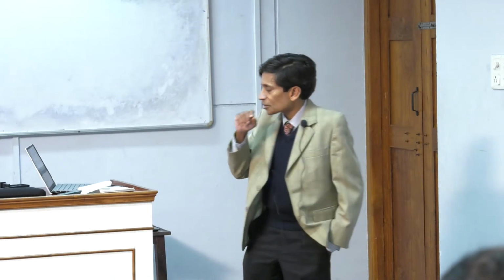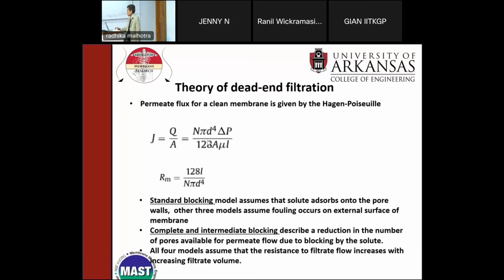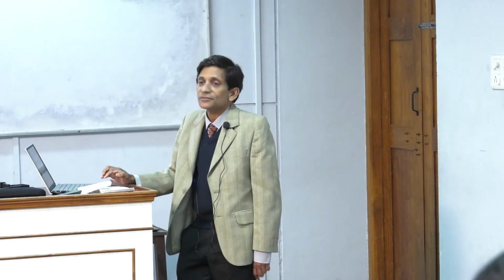Okay? If you want to know what the actual variables are, mu is the viscosity, A is the membrane surface area, L is the length of this, the depth, and then we have N, which is the number of pores, and D is the diameter of these pores. If you're not familiar with that, don't worry about it. It's just the driving force divided by a resistance.